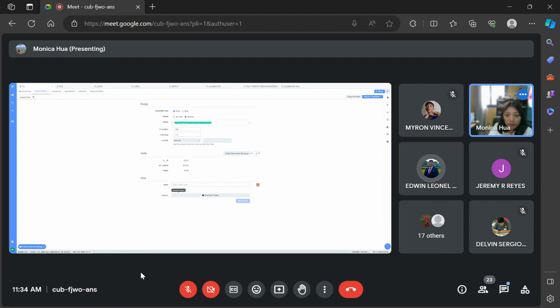That's a lot of base pairs. We've got to subtract to get the 20 though. Okay, that's fine. 45 is good. 35 is near 50. I will take it. That's going to be my reverse primer.